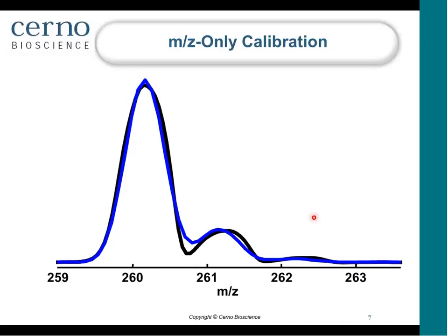leaving another spectral error in the rest of the mass spectral data. And that sort of spectral error on the order of 5 to 10% overall is perhaps all the difference there would be between one elemental composition and another. So it would have destroyed the differentiating power to tell one elemental composition from another. So that's the type of mass spec calibration that will have to be improved upon in order to take advantage of the full spectral information that's available from mass spectral measurements.